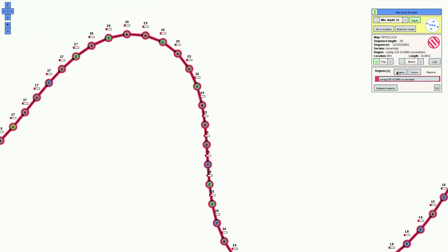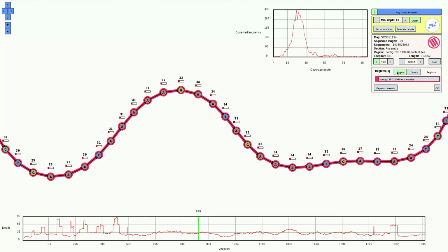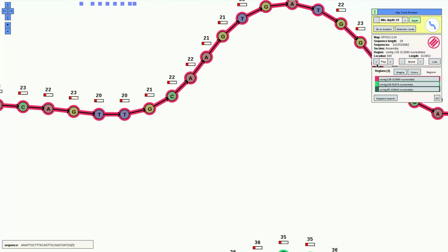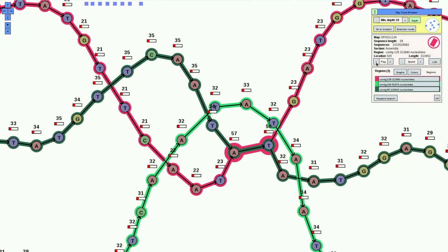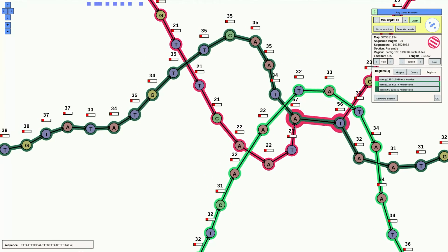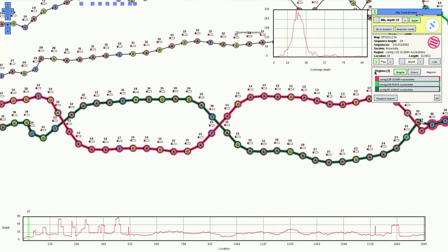That's nice, but where is the science? With this tool, I can inspect the structural relationships between DNA sequences found in a given sample. For example, here we can see one repeated region unwind into numerous strings that use it. Let's resume our journey in this part of the graph.